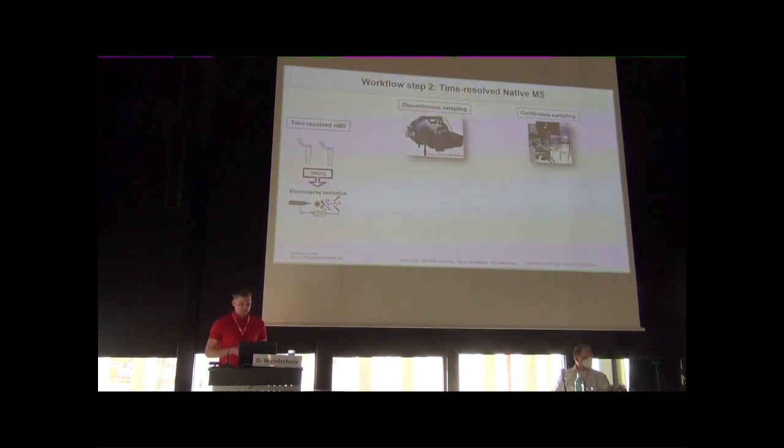Regarding the actual time-resolved native MS, we have to distinguish two different strategies. The one is a discontinuous sampling, which is mostly done by this Advion TriVersa NanoMate robot, and the other is the continuous sampling that I'm using. What is this robot actually doing?